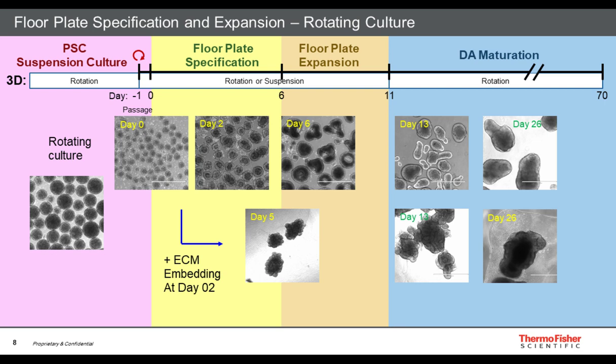By 2 weeks of differentiation, the embedded organoids seem to consist of convoluted sheets of cells. And by 4 weeks, that complex structure remains, but cells and neurites can both be seen growing out into the capsule of extracellular matrix.